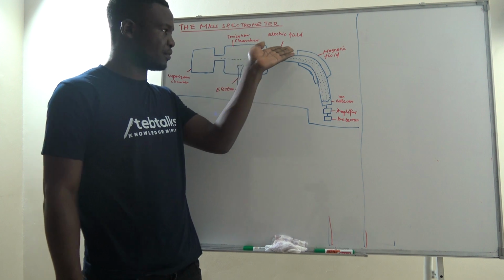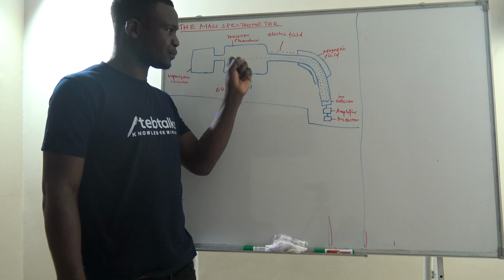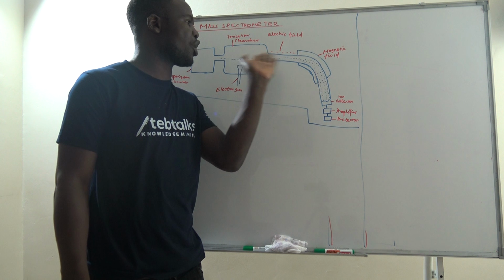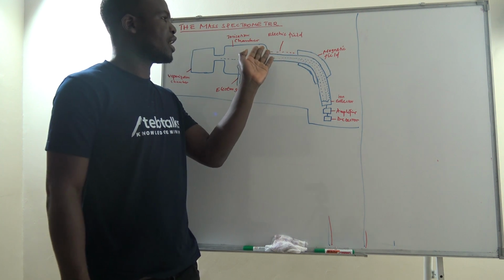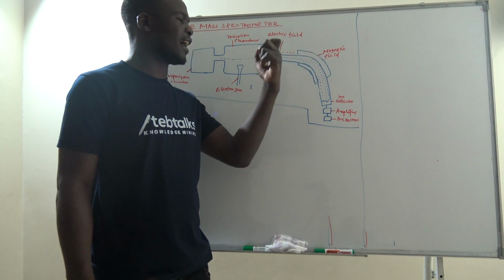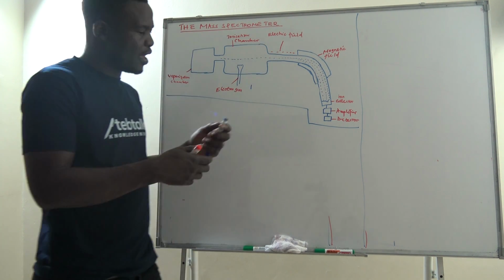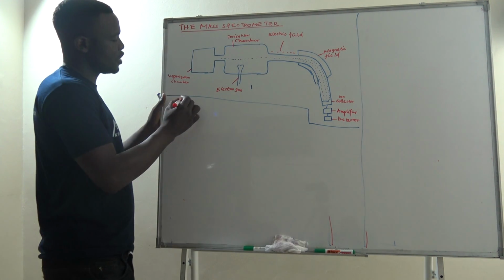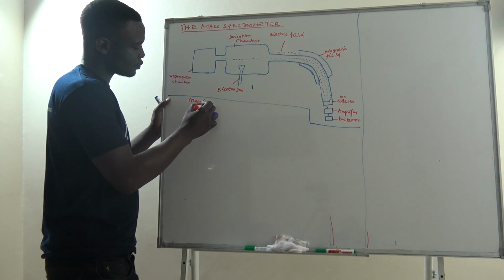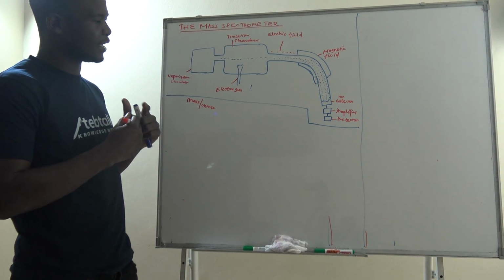Why do we use a negative electric field? Simply because these are positive molecular ions. Now, when these ions are accelerated in a straight line, they are then led to a magnetic field that deflects these molecular ions. Now, the extent of deflection depends on the mass to charge ratio.